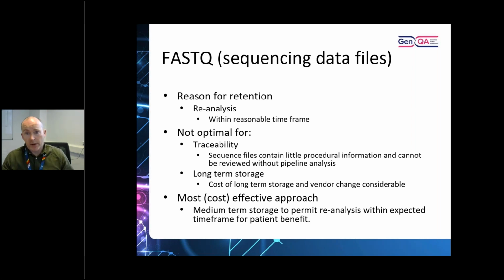But I think it's perfectly reasonable to keep it for a limited amount of time, maybe a year, two, whatever, but of the data files, excluding, say, pure raw data, it is probably one of the first ones that really should go when you're considering what you need to cut. Again, it's an opinion, but I'll stand over that one, really just on the actual complexity and the utility of the actual file itself and the data it contains. Go to the next slide, please.